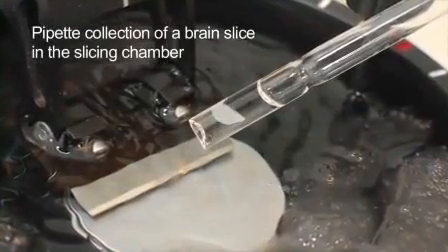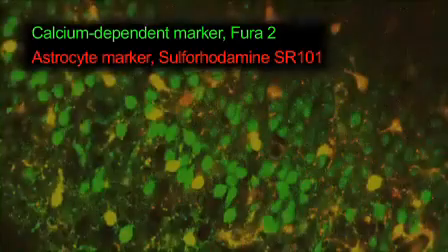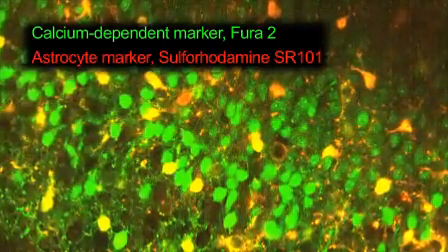Brain slices are made from the developing entorhinal cortex of a young mouse. Both neurons and astrocytes are loaded with calcium-dependent markers.